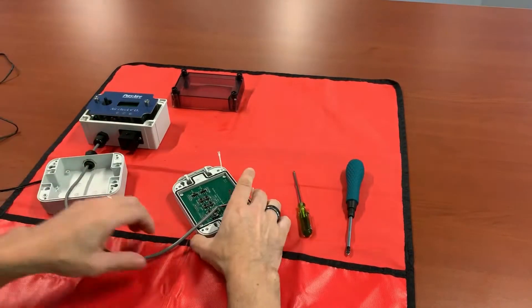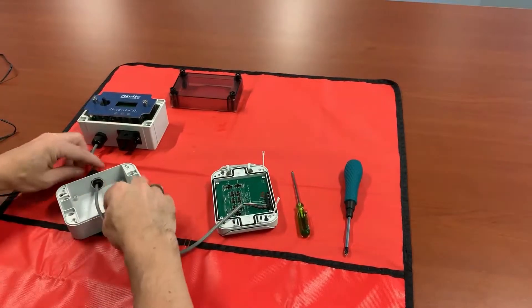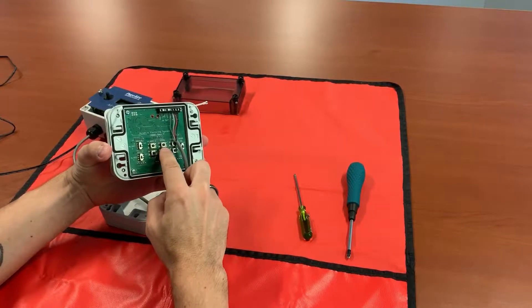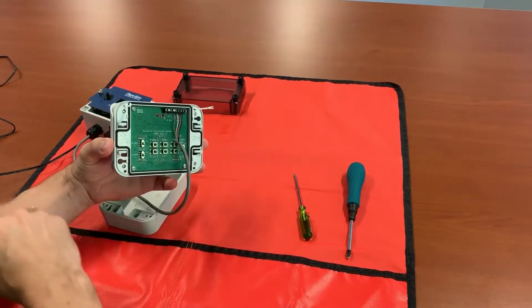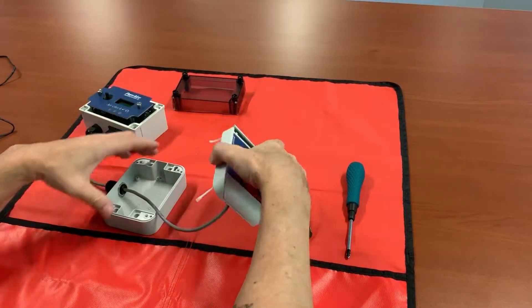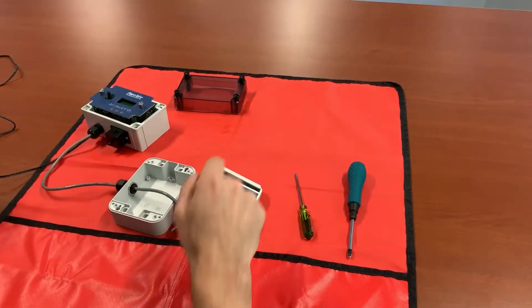Those are nice and tight. You don't want to put it back together just yet because you are going to have to access a few of these push buttons when we do the span and zero adjustment to sync our remote display to our monitor. So we'll go ahead and leave it sitting just like that and apply power.